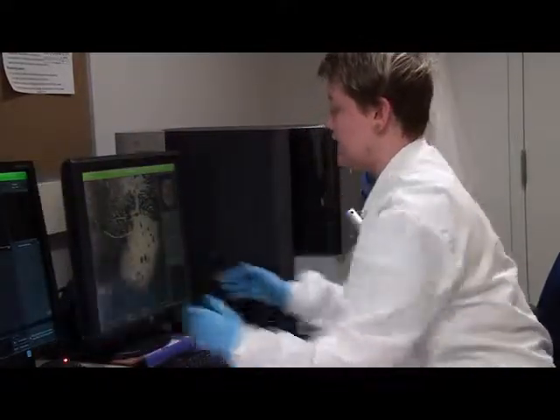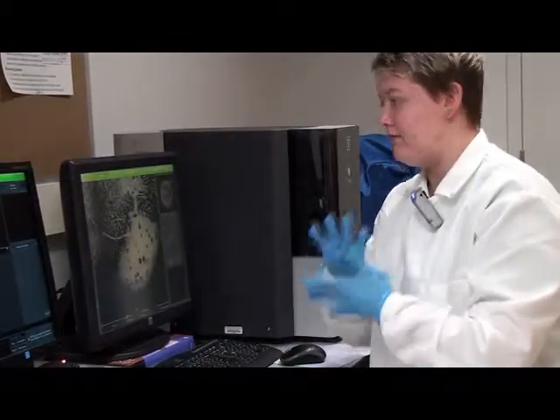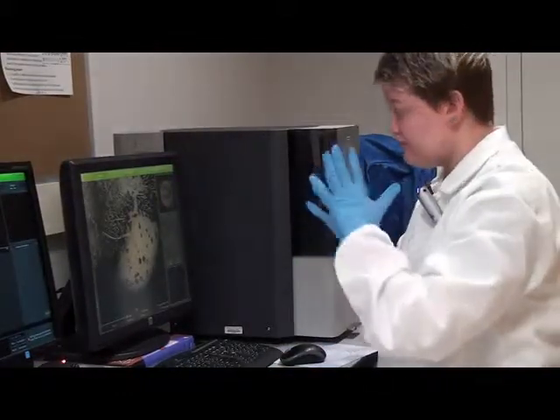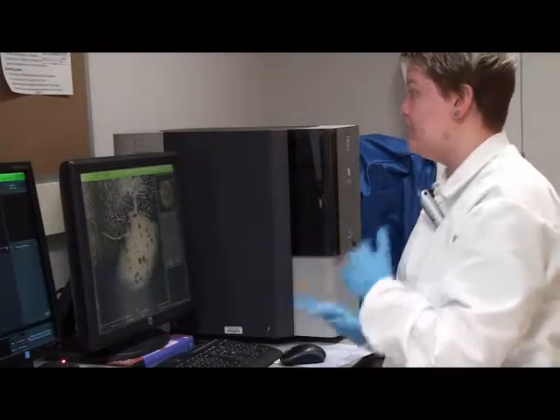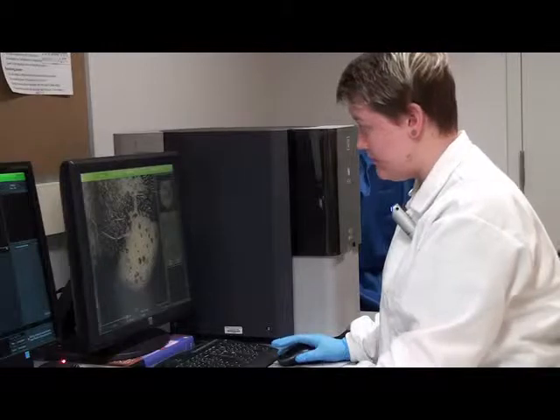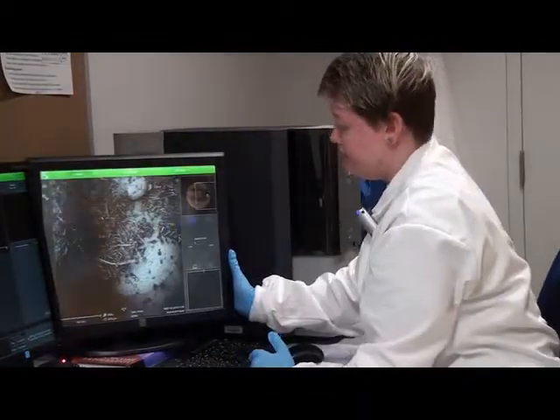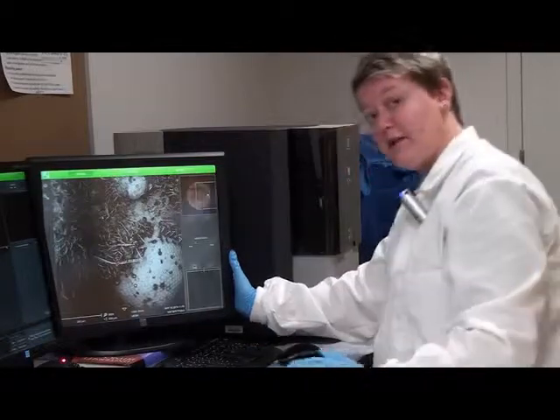There is nice contrast between all the different elemental compositions in the bug. And I love that you can see all these tiny little microscopic hairs — they are very cool looking and you don't get to see that with a light microscope.